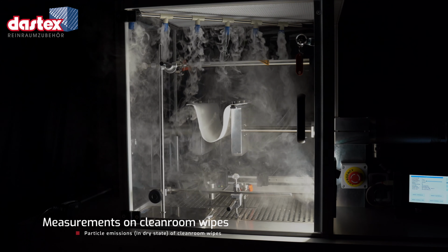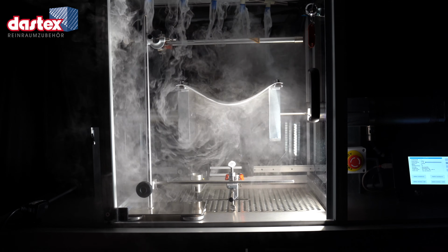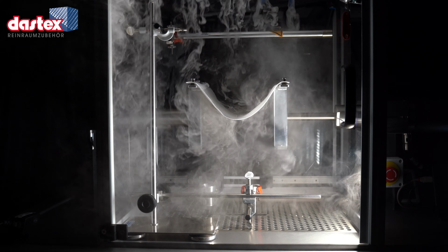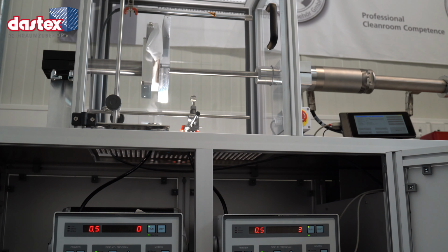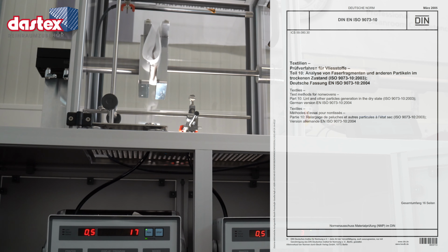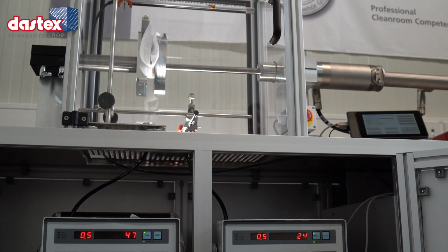DASTEX has set itself the goal of initiating further investigations with a modified measuring method into the recurring question, how many particles does a clean room wiper emit when dry? To this end, we developed our own wiper test rig based on the principle of the Gelbo flex test, described in DIN EN ISO 9073-10, for example. Our test stand is explained in more detail below.